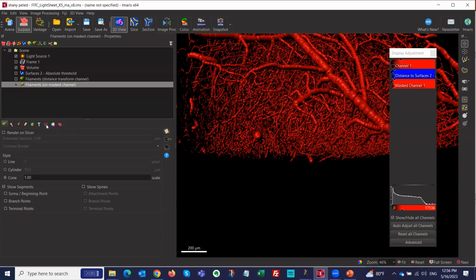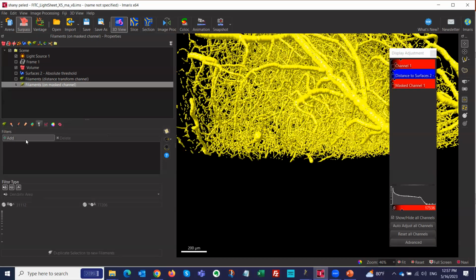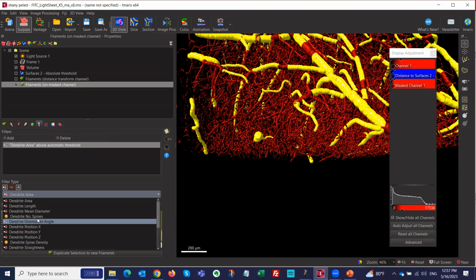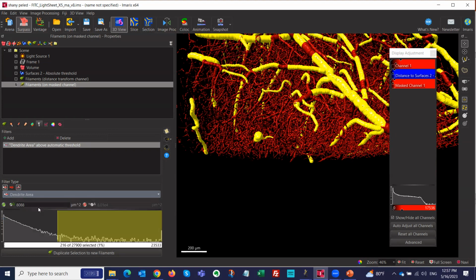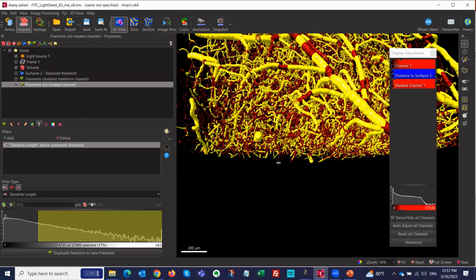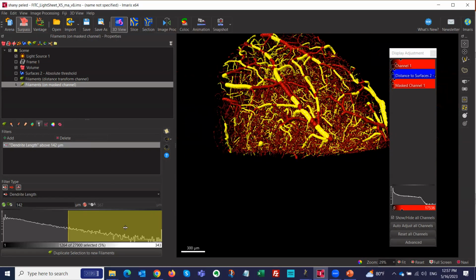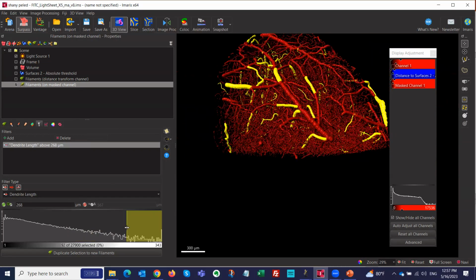Oh, yes. You can classify or filter based on filament segments here. Let's see, standard filament length, and then you can see, there's a little bit of a delay because it's 13 gigabytes and I'm on the laptop, but you can place a threshold based on the length. Or maybe based on the thickness.